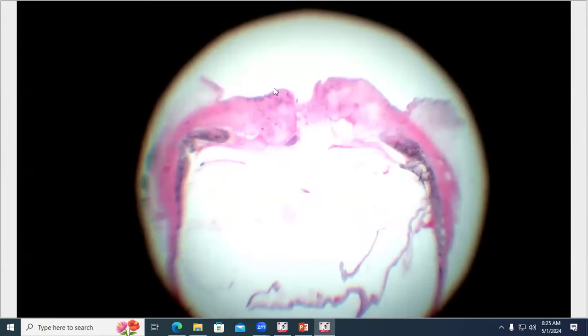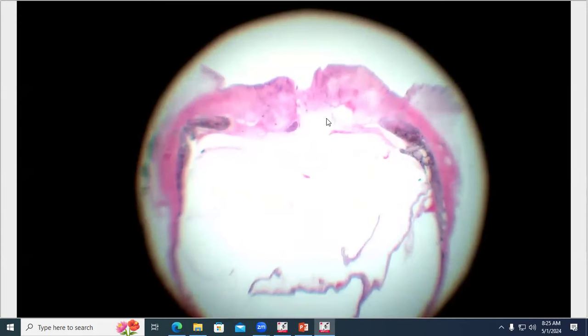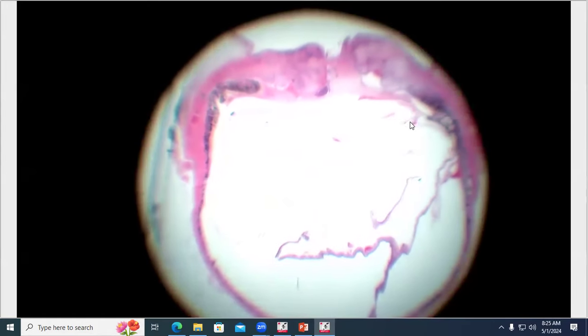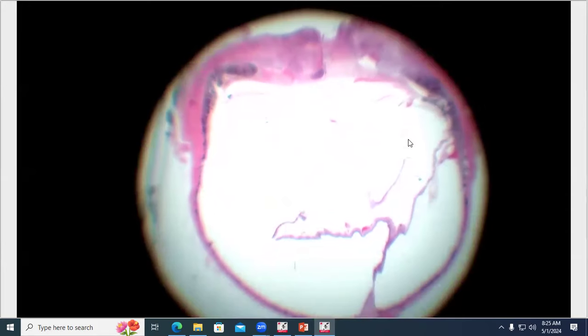Cornea up at the top, we can see that there is a little divot in here that should not be there. Again, iris leaflets here from the pigment that you can pick out. This is sort of leftover lens capsule. You can see it a little bit. It's a little bit square shape on the edges, and we'll take a closer look at that. And then again, our detached retina, a little bit torn as well.